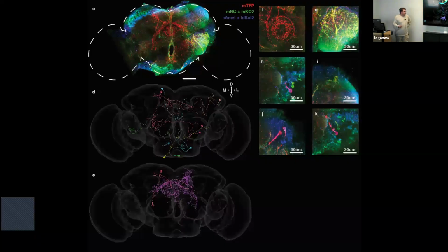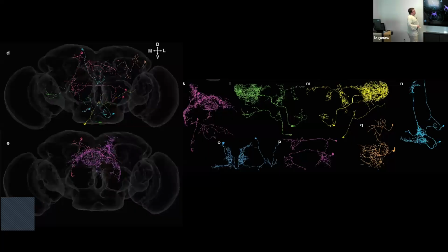So bringing this back to the line confocal context, we have a couple of data sets. This is a fruit fly central brain, basically with the 2 sides of it cut off, that we imaged. So this is a couple of terabytes, I think a 2 terabyte data set. And we went in and selected a bunch of neurons to reconstruct in this specific brain. So here's a couple of them projected down here. And bringing them out, this is what our tracings look like.